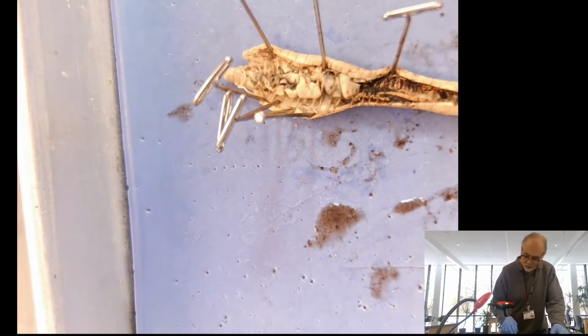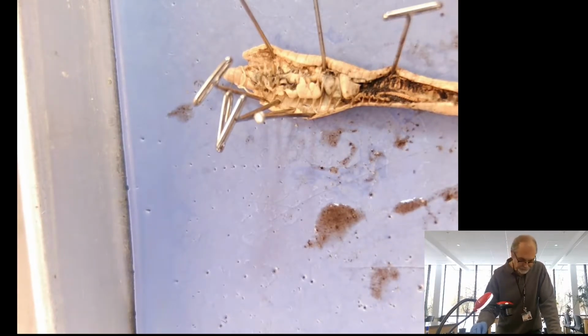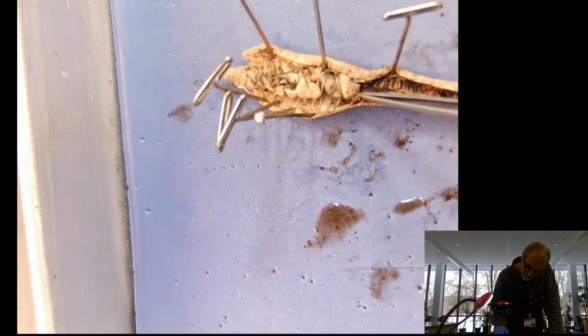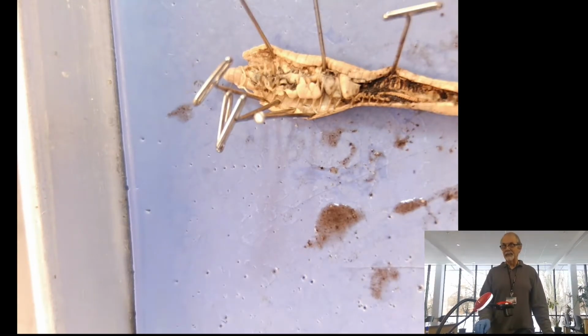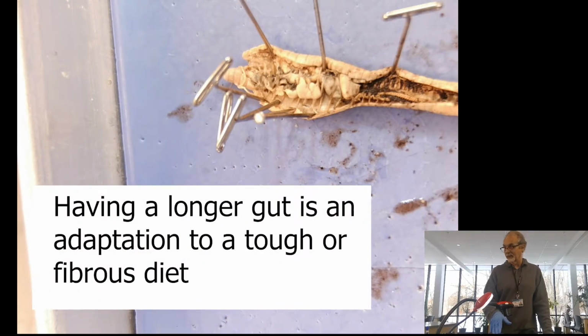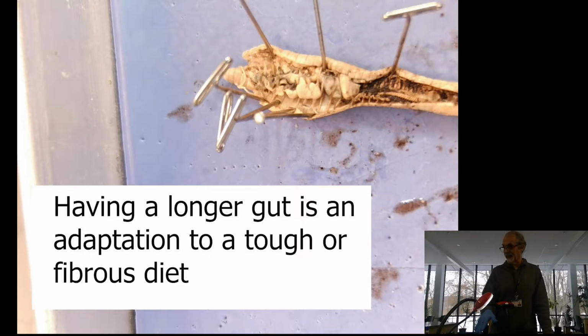Now, if I point to some things here, obviously from here on down is all intestine. And they really do need that much intestine because the type of organic matter they're trying to break down and digest is very resistant to digestion. Right. A lot of it's cellulose, right, which is difficult to digest. And so having this long of an intestine gives them the ability to slowly but surely break that down and be able to fully digest it.